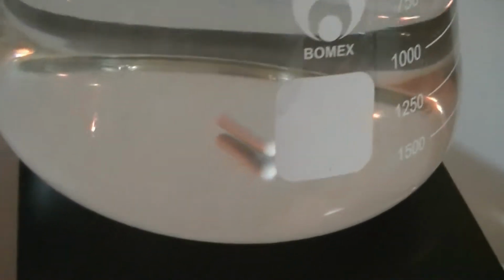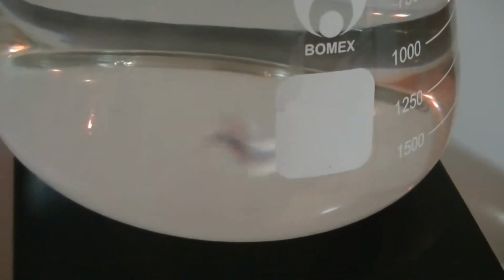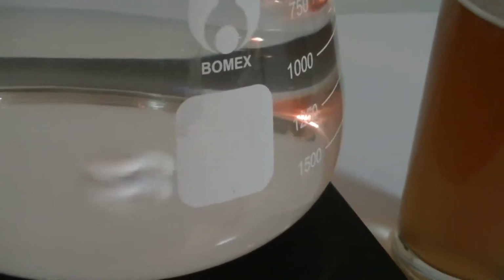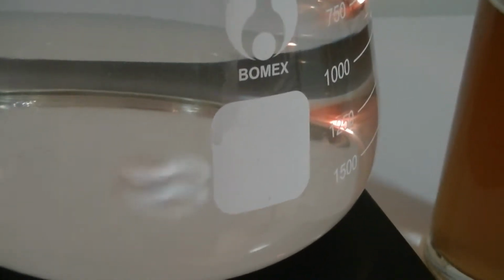Got an on-off switch, just turned it on. We got a little rotator knob here to start the spin. You can hear the fan starting to spin before the bar. I found if you go really slow with your corrections or adjustments on the knob here, the bar doesn't go flying off.